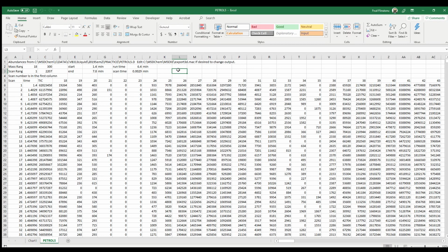But there are a few other things that we can do. For instance, we might be interested in where our decane is in this. We can work out the molecular mass of decane by knowing that there are 10 carbon atoms, each with a mass of 12, and also 22 hydrogens. So decane has a molecular mass of 142 grams per mole. These weights along the top here, we can use to our advantage.